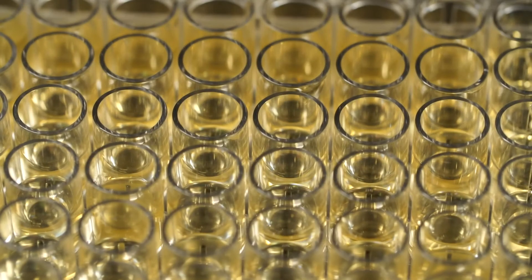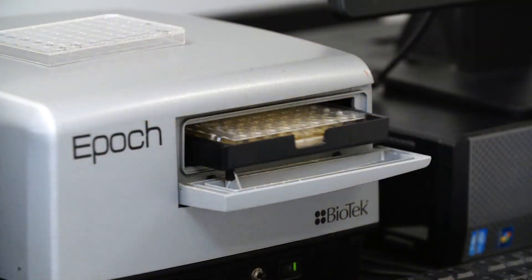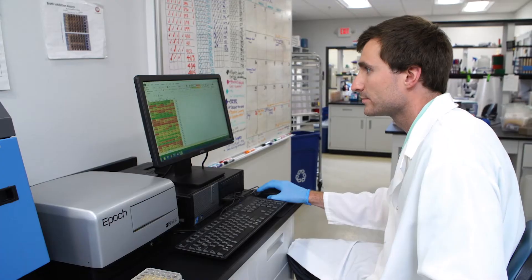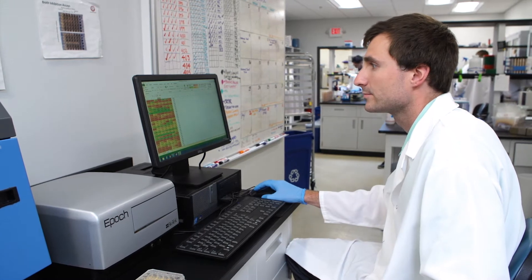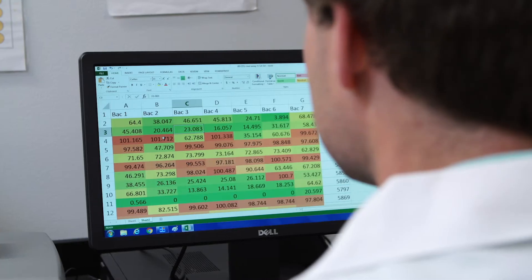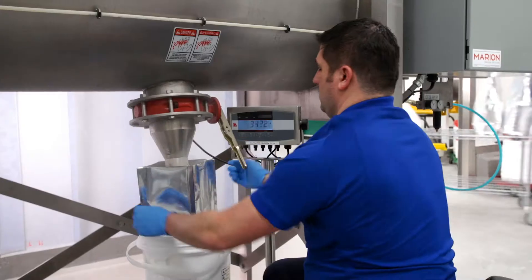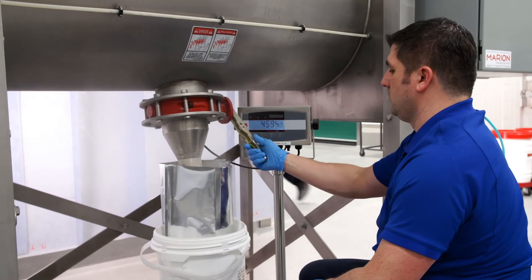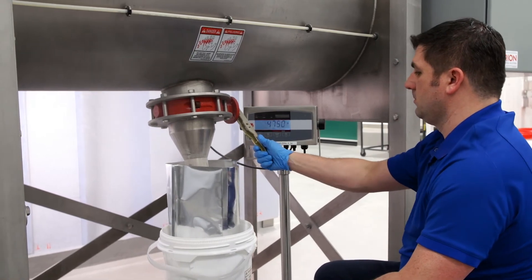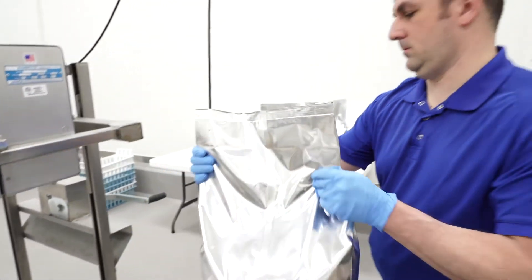E. coli and Clostridium perfringens isolates from each cluster are tested for inhibition with the supernatants of each commercial Bacillus strain. The compiled inhibition data of each strain tested against each Bacillus is used to make a heat map. The Bacillus strains with the broadest inhibition are selected and used to create a customized Certilis formula.